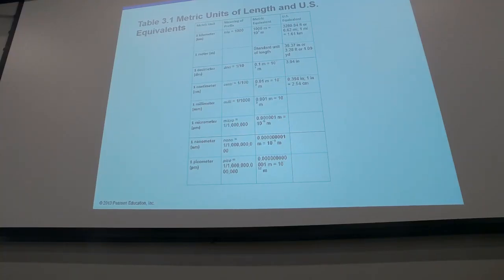And then we will see over and over again in some of these images from microorganisms how in the images they provide you a scale, and they give you this abbreviation in that scale, meaning how big can be that object when you move that bar, scale bar, into the image so that you can observe it easily.